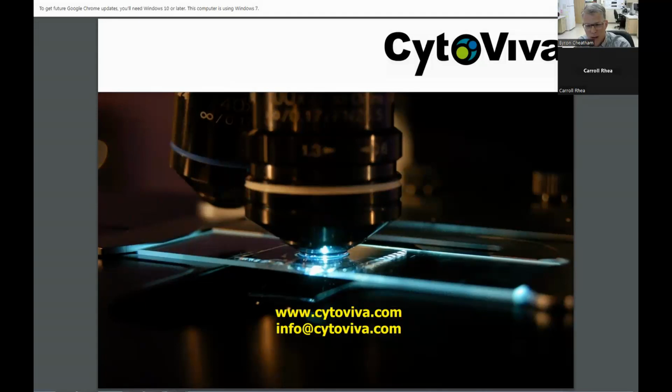They don't have to be dried per se, but they don't need to be in so much solution that they're swimming or Brownian motion is taking over. You want to have such a small amount or such a large cover glass that your surface area allows these nanoparticles, even in solution, to attach to the cover slip or the slide through charge properties so that you can image them. That's a very nuanced sample prep process that most people have to figure out relative to the details of the chemistry of their sample.